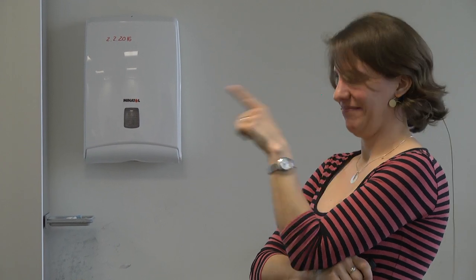I mean, I just need a calibration curve for this. Not even that, I even allow you to do only a single point calibration. Okay, you don't even need that. But it would be good, right? So you just need to spike a known amount.